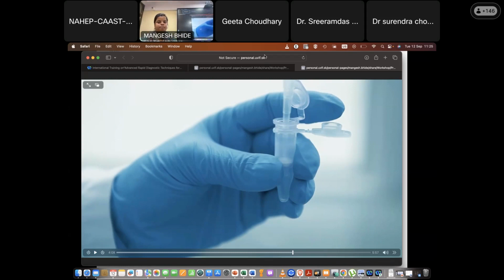There are around 20 different types of silica, but only type B will bind DNA. Not all. You can purchase type B, and it is really cheap. I recommend purchasing from Merck. It was previously Pall Corporation, now it is Merck. So you can purchase silica type B and make your own columns.